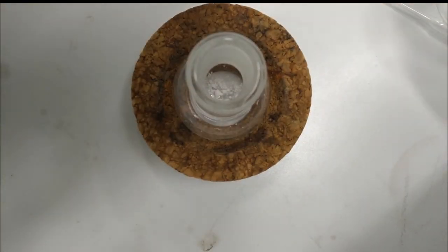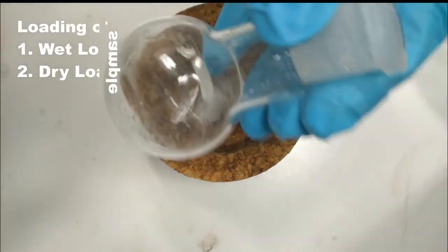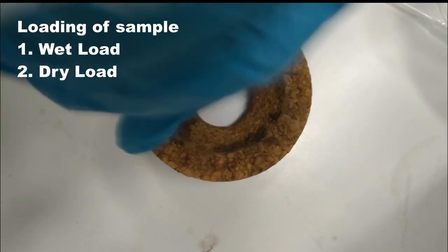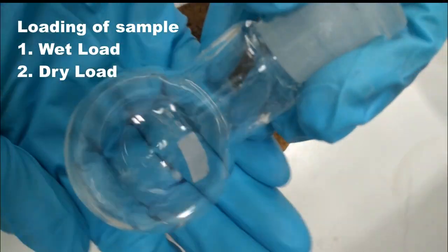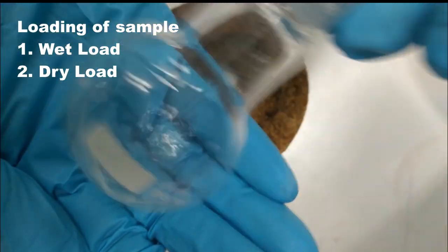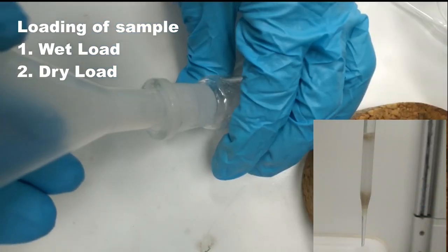Moving toward the most important part of column chromatography is to load the sample. It has two ways: either wet load or dry load. For wet load, you need to dissolve compound into minimum amount of solvent and directly pour onto the top of column.